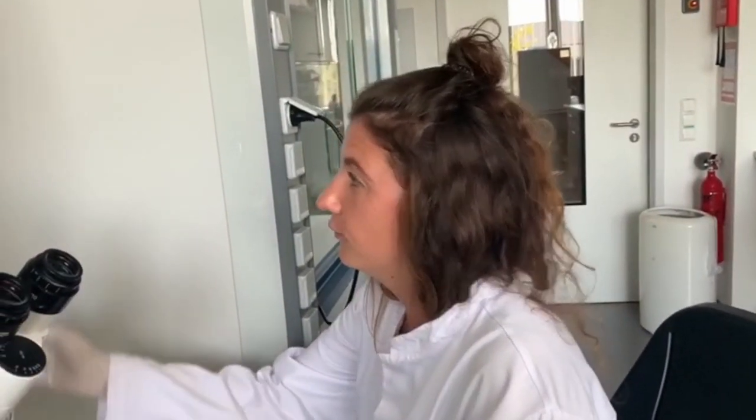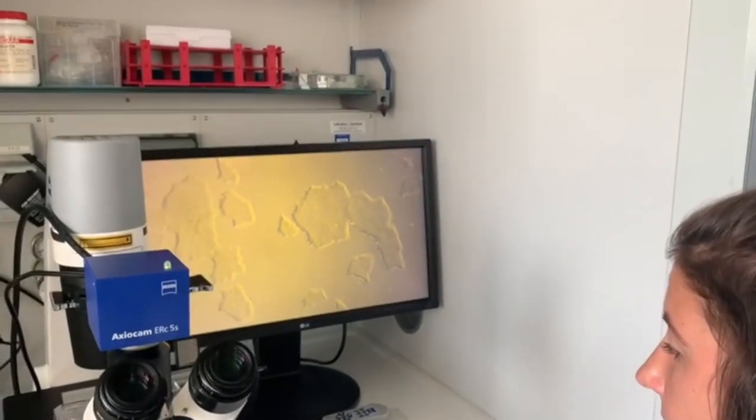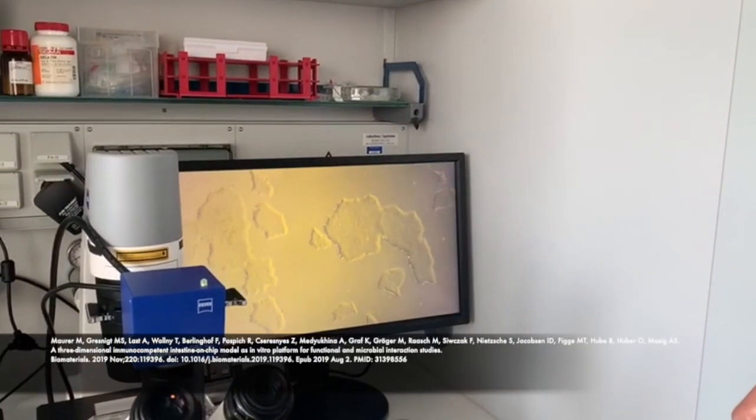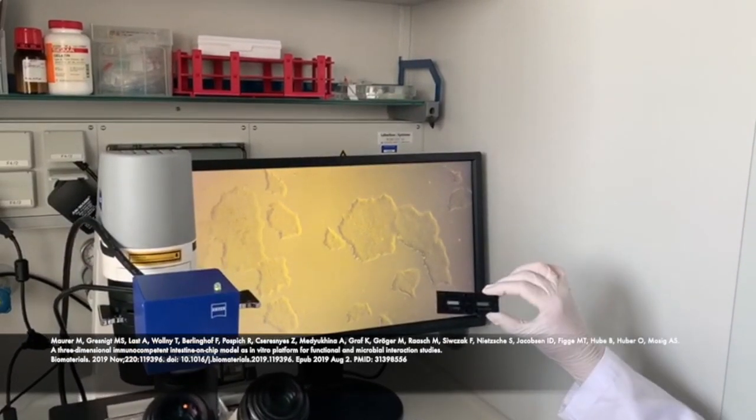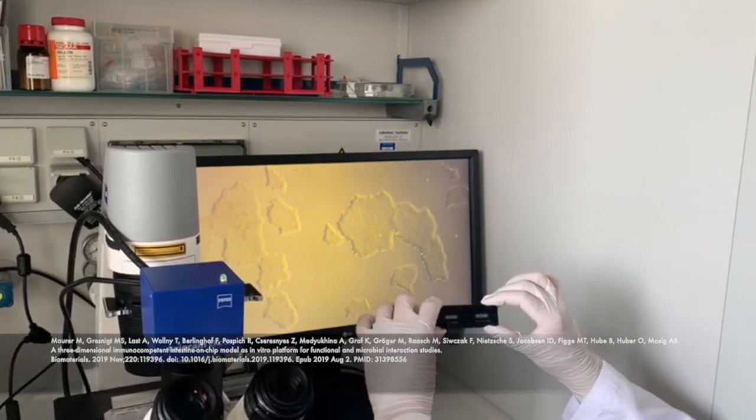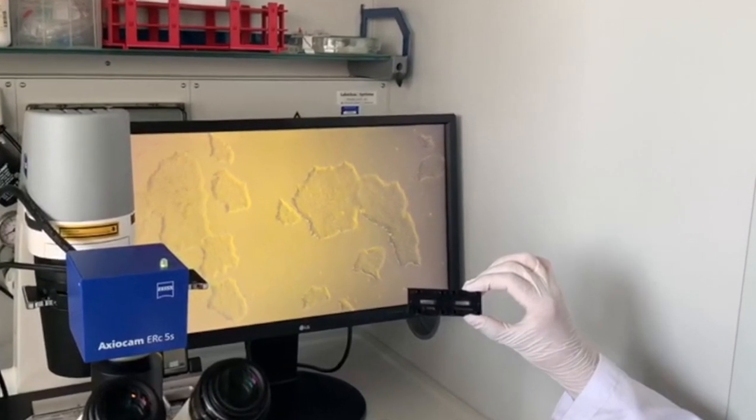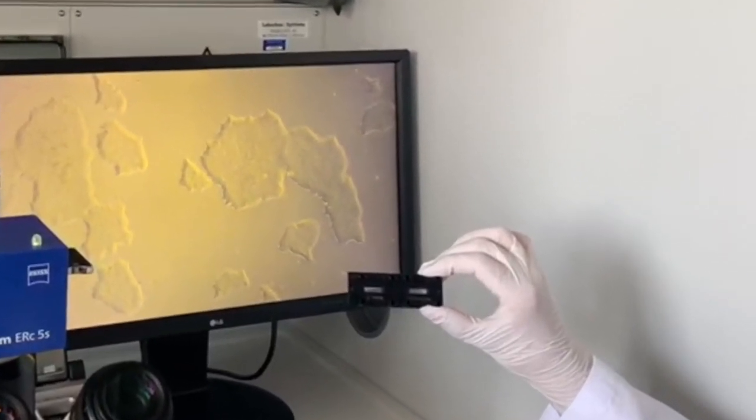My name is Matilda Kaminska and I'm a PhD student at Leiden University Hospital. I'm also ESR number five and part of the UROX. For my research, I'm developing a better model of the intestinal system and I'm doing that using human induced pluripotent stem cells. Stem cells like these can be isolated from skin of patients. Then they can be inserted and grown on microphysiological chips such as this one. Finally, we can then have a patient-specific model that both enables disease modeling but also specific drug testing for that patient.